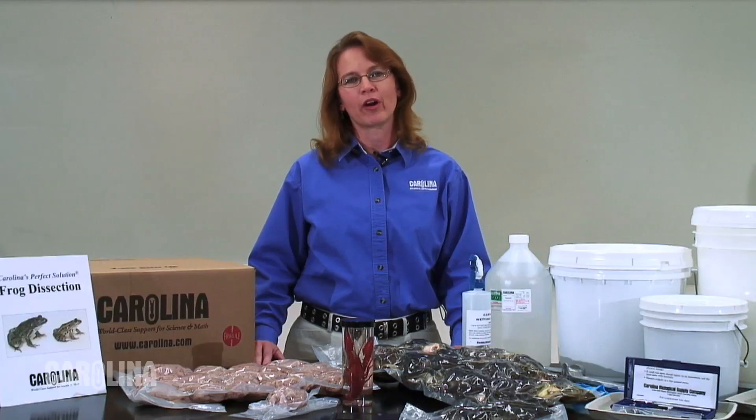Hi, I'm Tammy Sadler with Carolina Biological Supply Company. We often get questions from our customers regarding what type of packaging to choose when ordering preserved specimens. The type of packaging you choose is important, not only for receiving the specimens, but also for storing them over an extended period of time. I will take you through some of the choices available so that you can make the best decision for your classroom or lab.